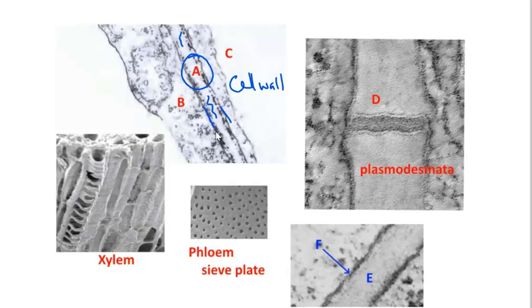So of course we are looking at a plant cell structure. On this side and this side of the cell wall is the cytoplasm, and then this membrane here, and indeed this membrane here, going into zone C, I guess we could put zone C as well.